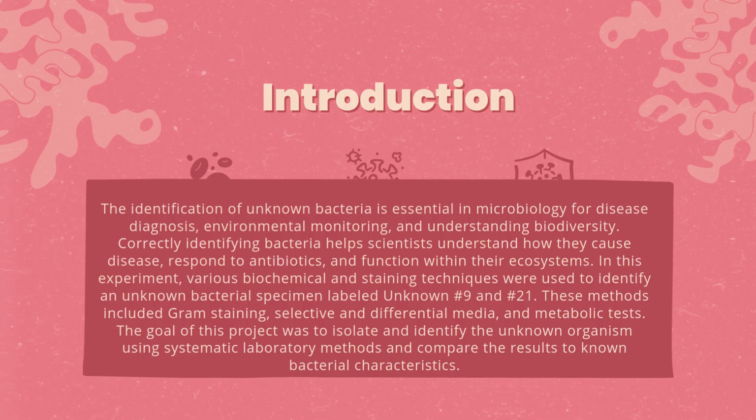The goal of this project was to isolate and identify the unknown organism using systematic laboratory methods and compare the results to known bacteria characteristics.